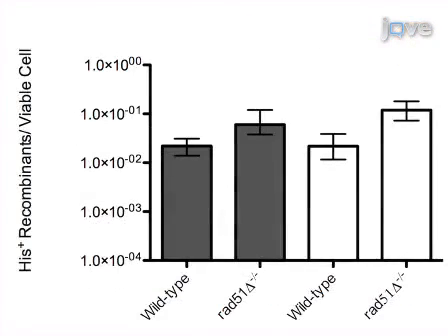Ultimately, results can be obtained that show genetic control of translocation formation by single-strand annealing through changes in the frequency of HO-stimulated translocation formation in strains of different genotypes.